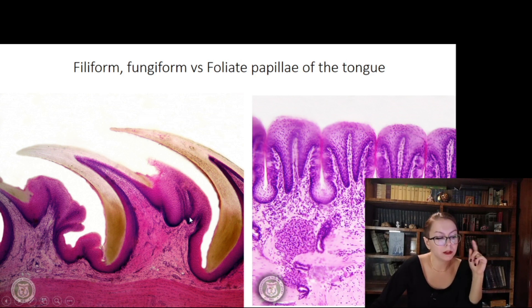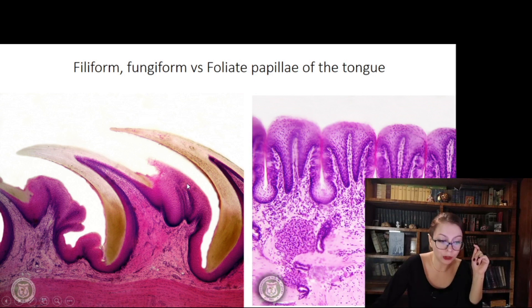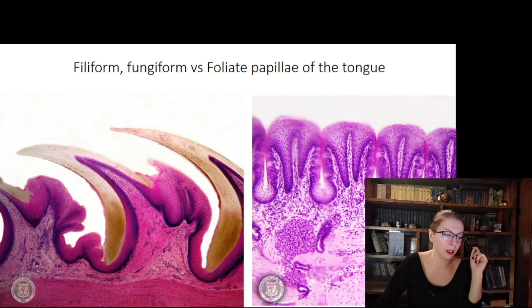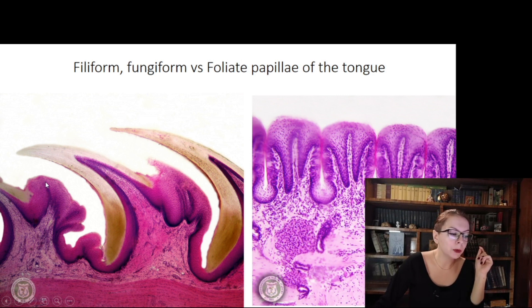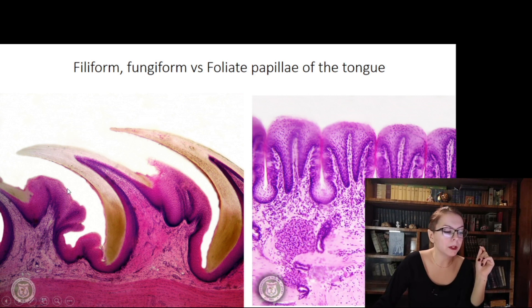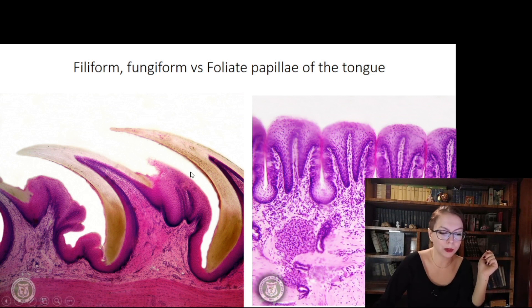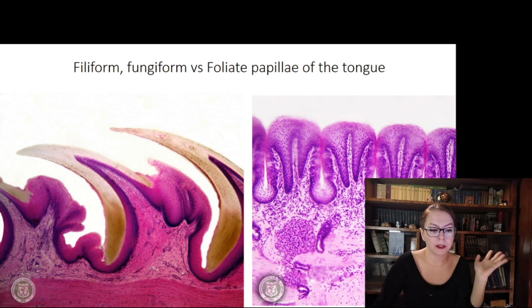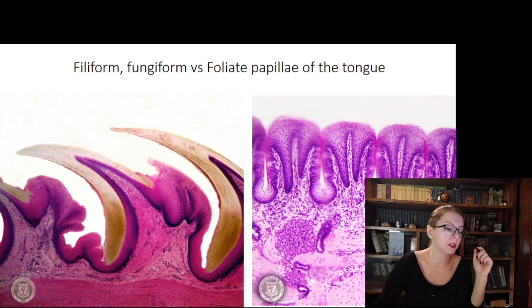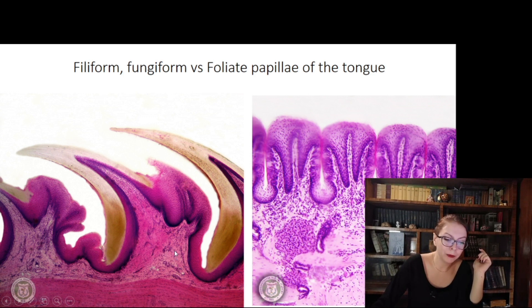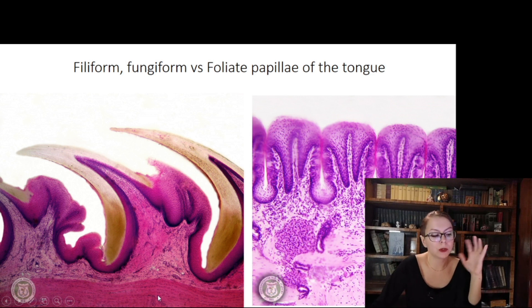To distinguish fungiform from foliate papillae, the key difference is the presence of secondary papillae — projections of connective tissue inside the epithelial covering. In fungiform papillae, connective tissue is located very close to the surface, and blood vessels give a red color to the fungiform papillae precisely because they are located very close to the surface lining — and that is what helps us distinguish them from others.